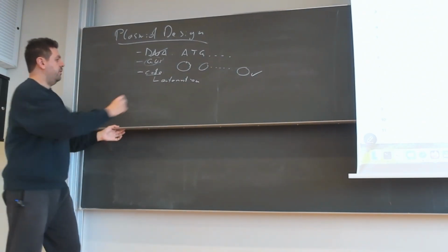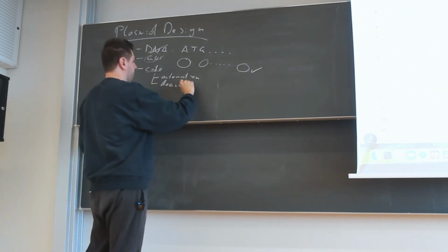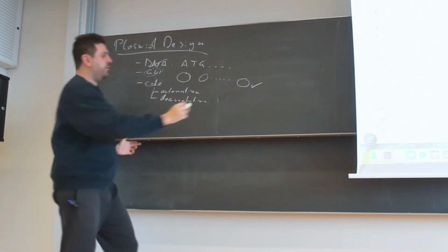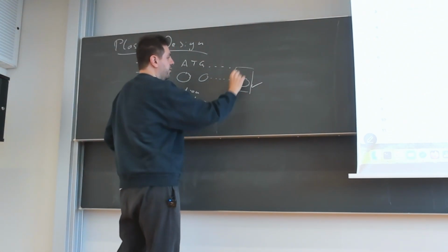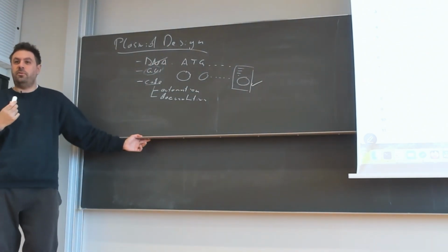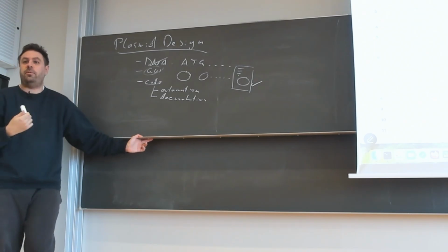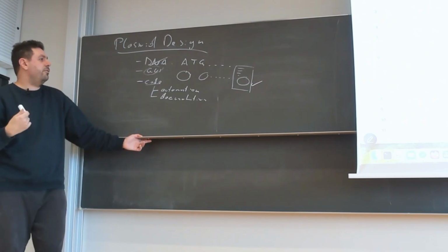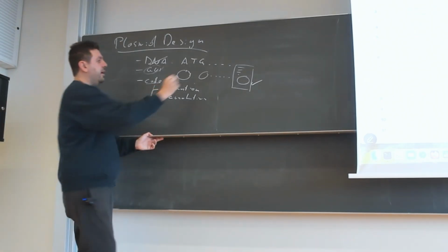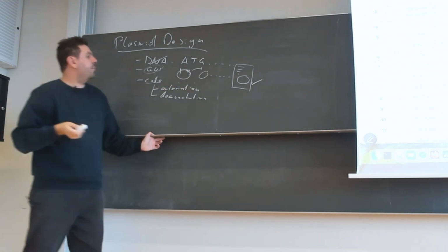But there is a second thing here. This is documentation. Code is documentation. If you give me, for example, your nice spreadsheet with the plasmid inside, I have to totally trust you. There's no easy way for me to verify it, or to redo it myself, or to learn from what you did. You can give me all these documents, but still, imagine I make a mistake when clicking from here to here. I paste not this sequence, but that sequence. I'm actually making a mistake.